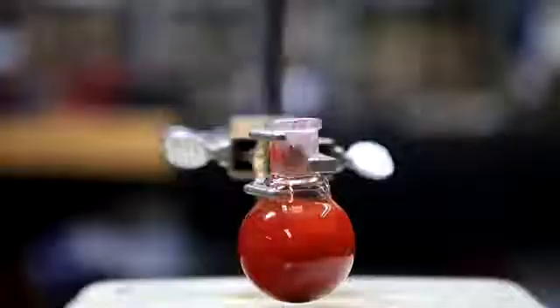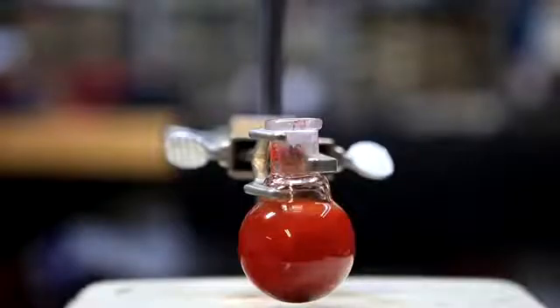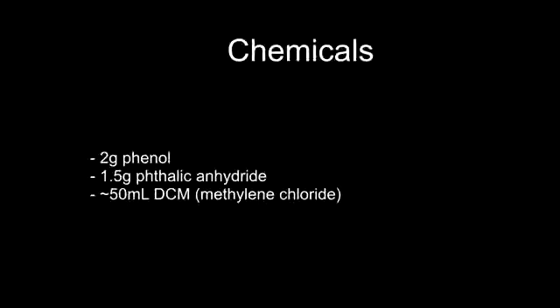Phenolphthalein is an extremely useful acid-base indicator and medically it used to be used as a laxative. For this experiment I used 2g of phenol, 1.5g of phthalic anhydride and I think having about 50ml of DCM would be good.